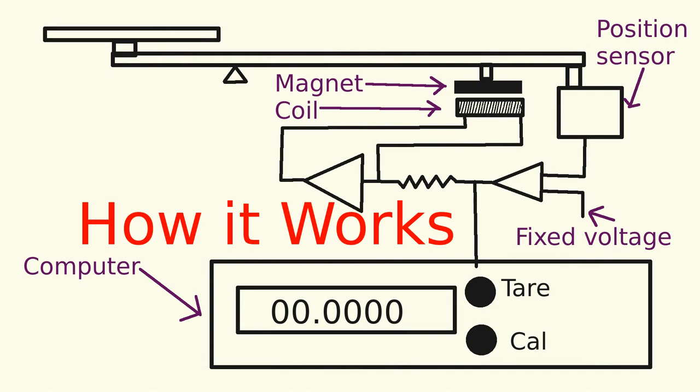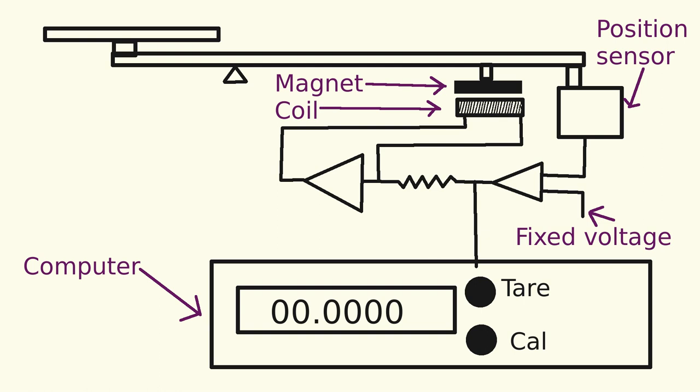The principle of these balances is that you have a balance mechanism of some sort, and it has a coil and a magnet — or a coil and electromagnet. The slot and vane sensor is just a vane in front of a slot so that you get an amount of light, which is amplified and compared to a reference. If it changes, the force on the magnet is changed to restore it back. Nothing moves when it's weighing, which means the flexures don't flex or anything else of that nature, which makes them capable of measuring very sensitive amounts.